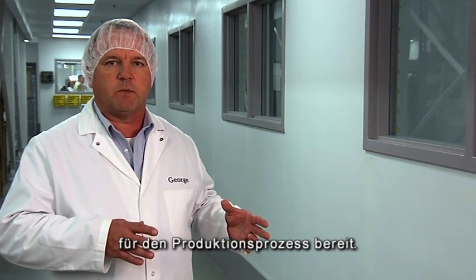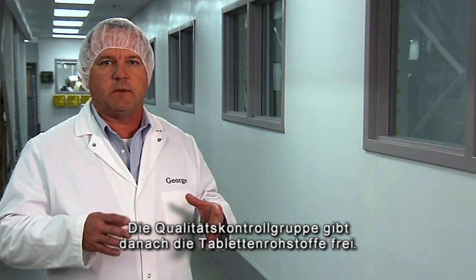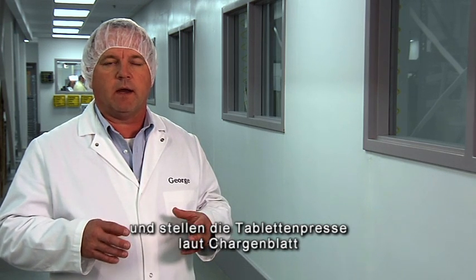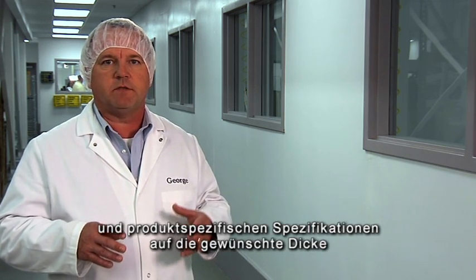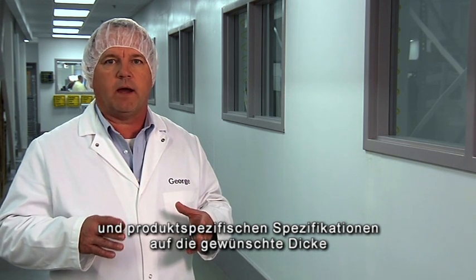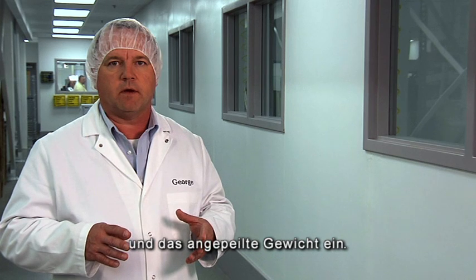Tableting at the beginning of the production process stages their material, and then quality control comes in and approves the material to be tableted. The production people will then take the powder, start the tablet press, and begin making adjustments to the tablet press until they've achieved the proper thickness and weight of the tablet, according to the batch records and specifications for that particular product.